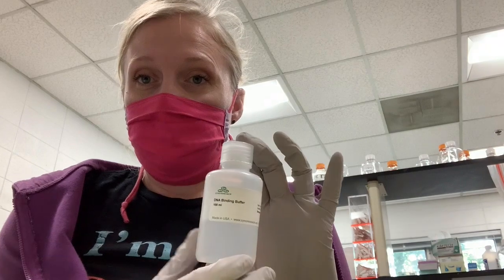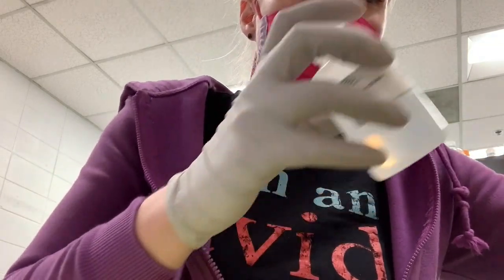And the last thing I wanted to say was, you may have many samples and you need to be very careful when you're pipetting that you keep them straight so that sample 1 goes into tube 1 and so on. You don't want to mix them up. You don't want to put them in the wrong tubes, or else your downstream applications may also have mixed up samples. Okay, so when I'm done with the DNA binding buffer, I always put it away.